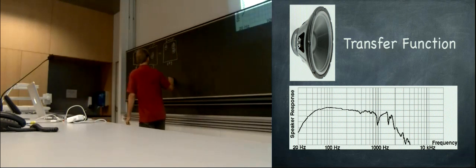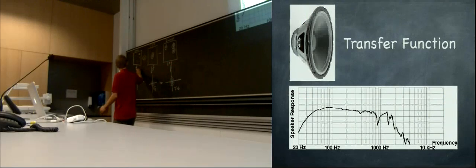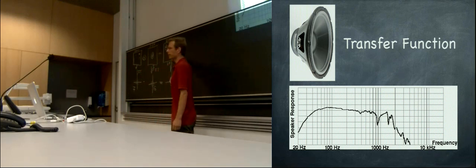And this gives you another Fourier transformation, which then has another funny structure there. I don't know what it looks like. And this is F times G multiplied. And when you back transform this, so this would be the Fourier transform, and this is the Fourier transform, and this is the Fourier transform minus 1, the inverse transform. Then you are back here.